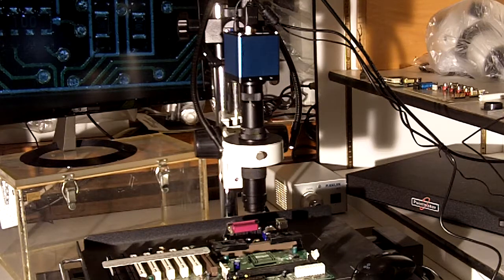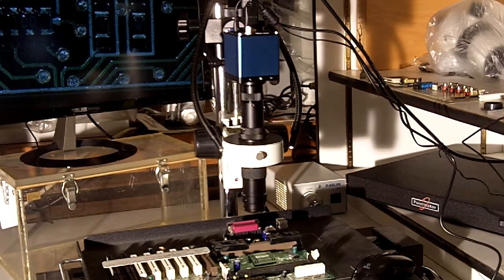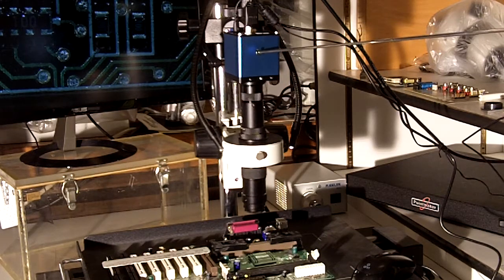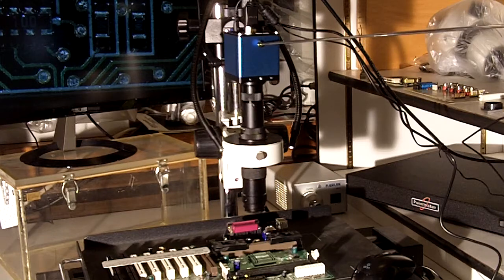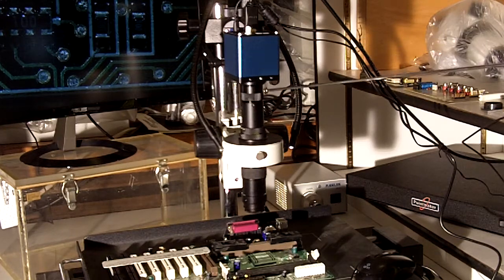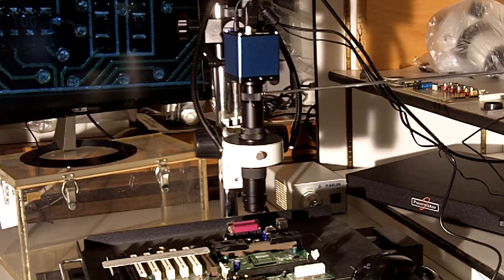High definition microscopy can be achieved with the use of a high definition camera mounted onto a microscope of your choice.